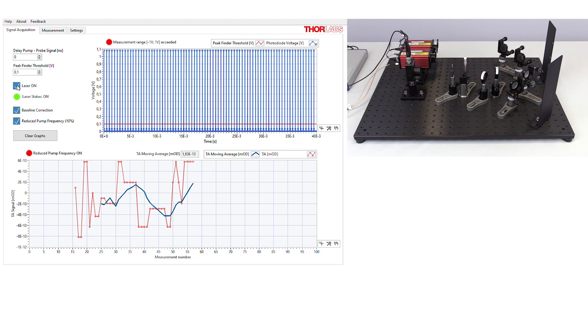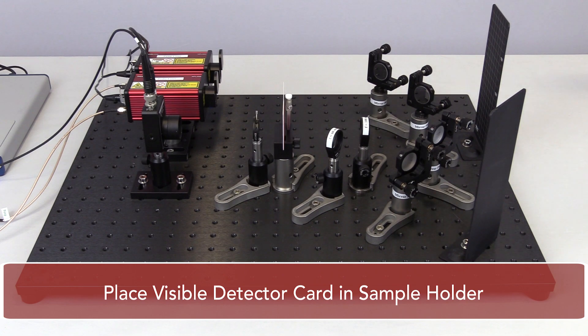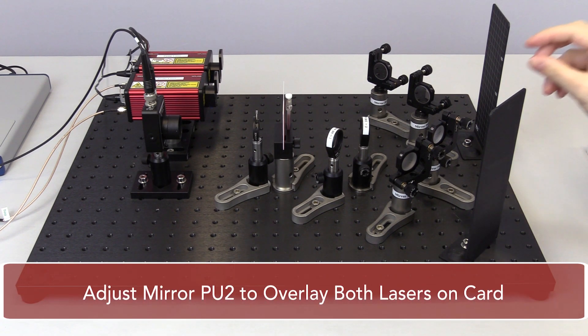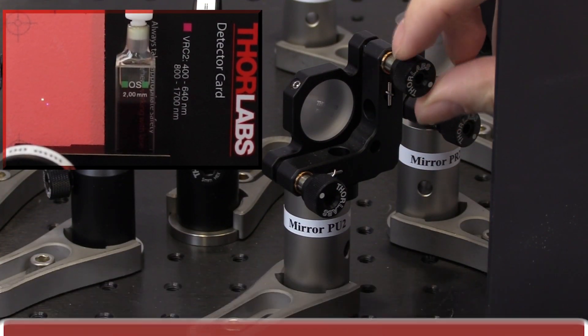To help view the beam positions, place the VRC2 visible detector card in the card slot of the sample holder. Then, use the mirror mount adjustment knobs to overlap the green pump laser beam with the probe laser beam.